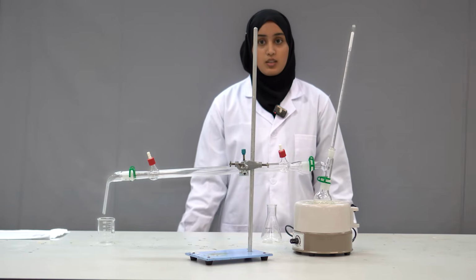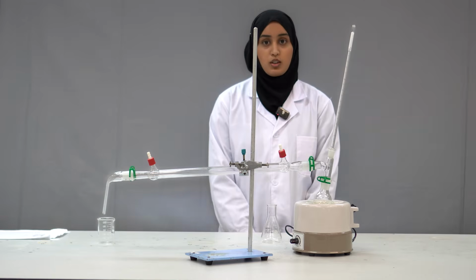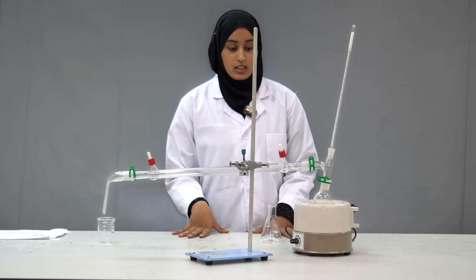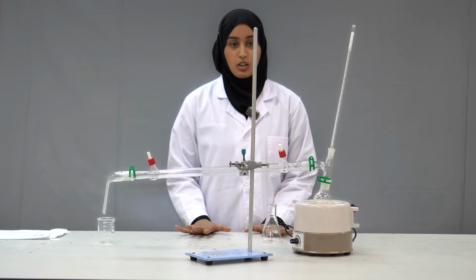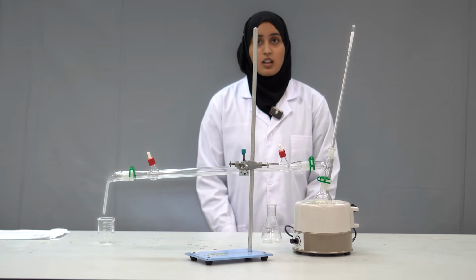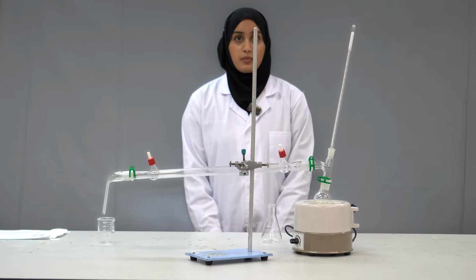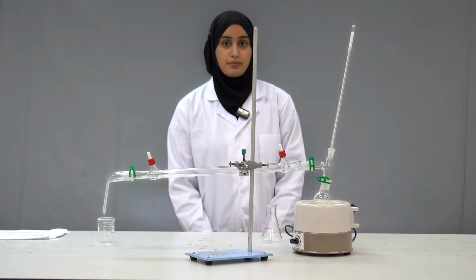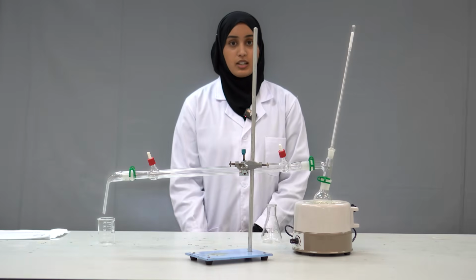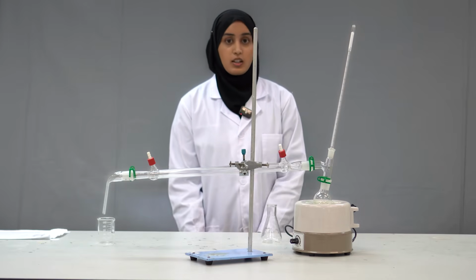So distillation is one of the most fundamental separation techniques which we use in not only labs but also in most industries. Distillation works on a really simple phenomenon, that is different liquids boil at different temperatures. In chemistry we deal with a lot of mixtures, but how do we separate them? Or more importantly, how do we separate them without changing their chemical composition? That's where we use distillation.